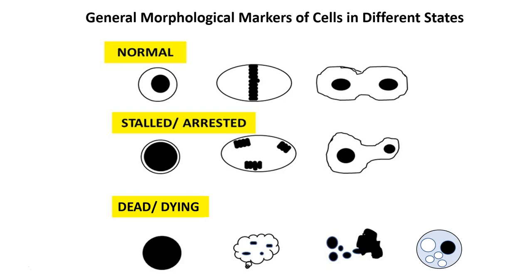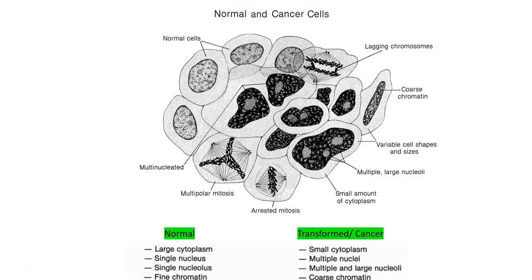However, there comes a point of no return, obviously, where there's just nothing left over. The cell contents are so damaged at that point that they will eventually die out. Now, many times when we are working in our class, we work with cancer cell lines because they are easier for students to handle. There are some additional markers that we look at for cancer cells or transformed cells.